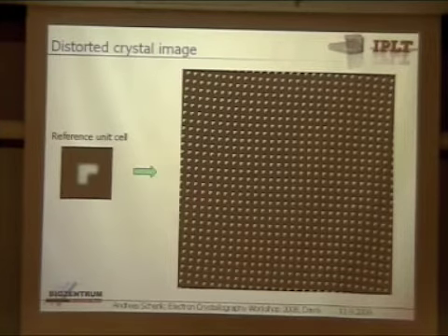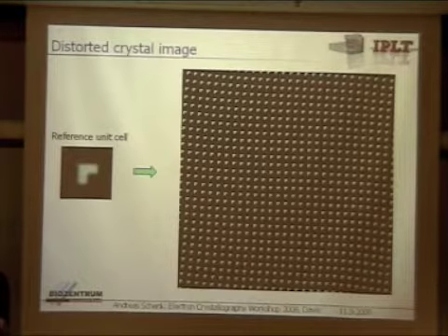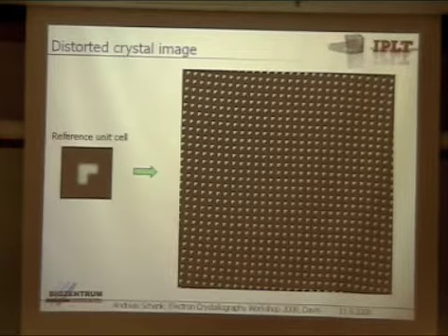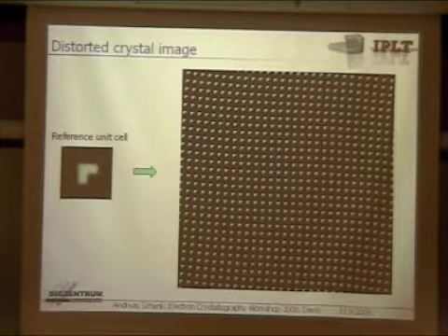For bad resolution crystals this is what we see, but we should get a good feel for how close this is to the reality we are dealing with. There's one option which I plan to do but didn't have time for yet: take an artificial unit cell where I know the amplitude and phase, and then apply a real distortion vector map from an experimental image.